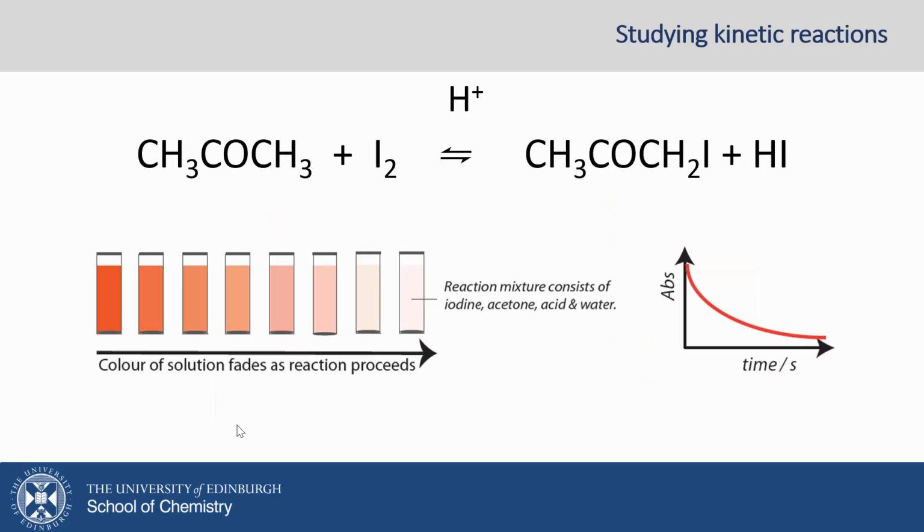So here's a kind of a schematic as to what's happening. We have our reaction mixture that we're measuring in our UV visible cuvette, and the concentration of our reactants decreases over time, so therefore we can measure the rate of reaction, which will be the slope of our decrease in absorption as a function of time at any particular time.